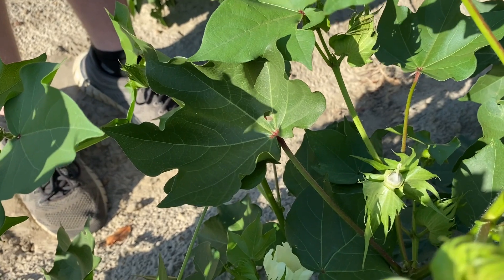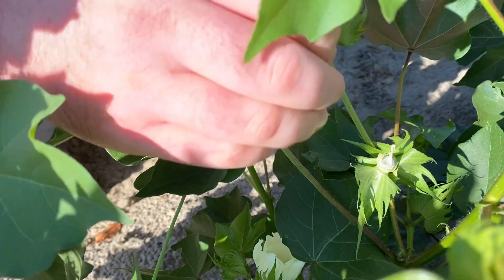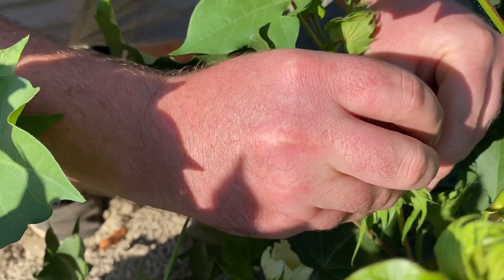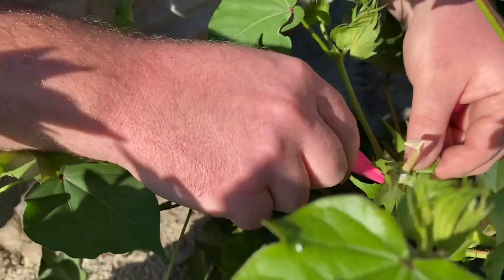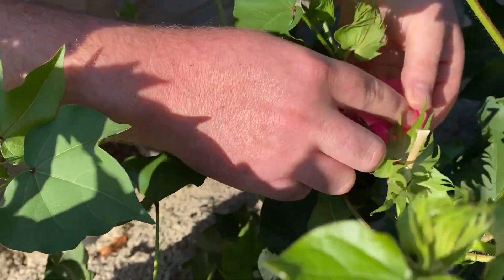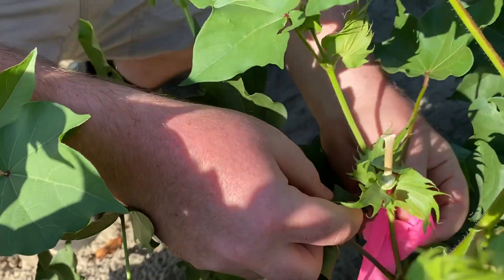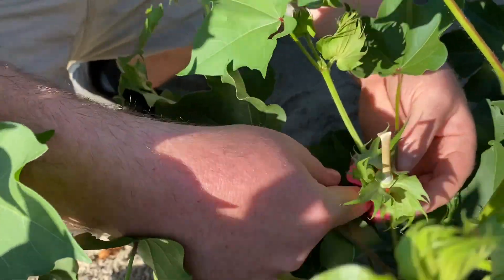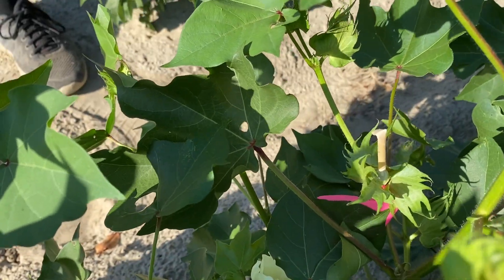Next, the stigma and style needs to be covered using an appropriate size paper straw. The straw should be a little longer than the stigma and style and can be carefully placed over the female organs, and the tip should then be crimped. This will prevent any unwanted pollen from fertilizing the flower. The last step for the first day is to wrap some bright colored ribbon around the stem of the emasculated flower so as to easily find it the following morning.